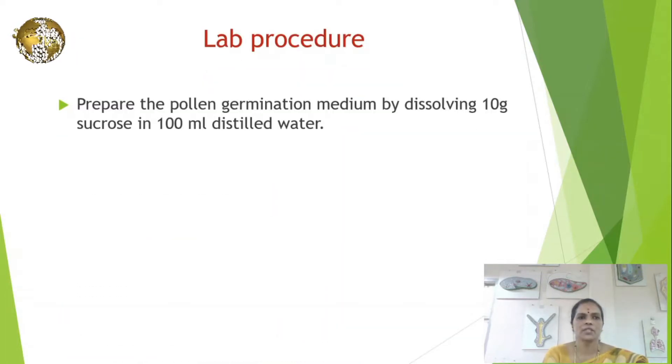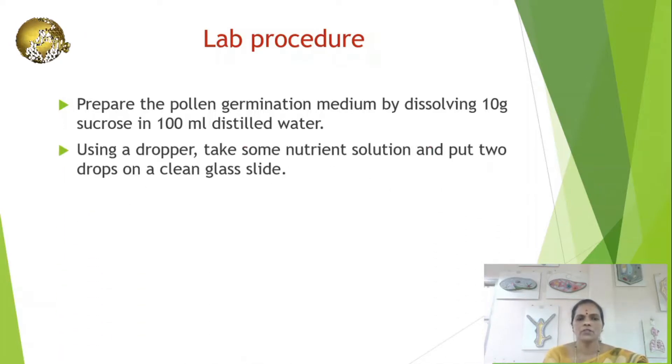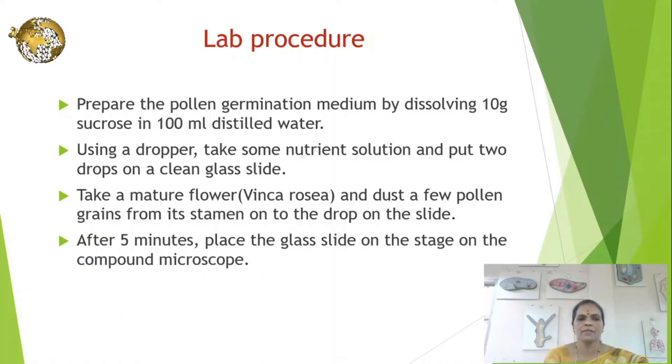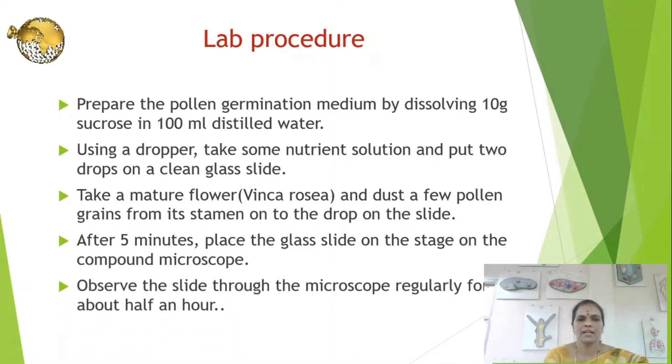Coming to the lab procedure: prepare the pollen germination medium by dissolving 10 grams of sucrose in 100 ml of distilled water. Using a dropper, take some nutrient solution and put two drops on a clean glass slide. Take a mature flower - we are going to use Vinca rosea - and dust a few pollen grains from its stamen onto the drop on the slide.